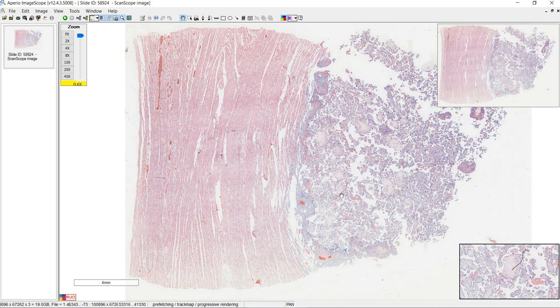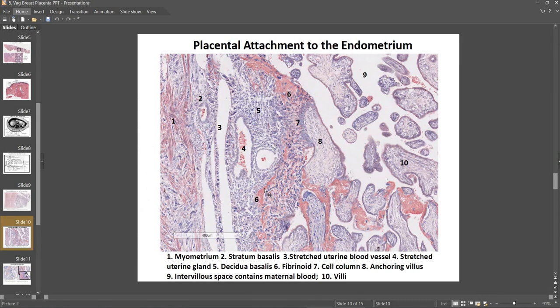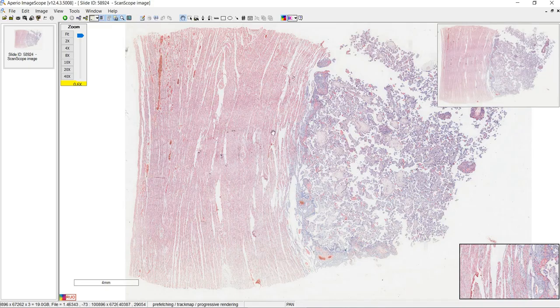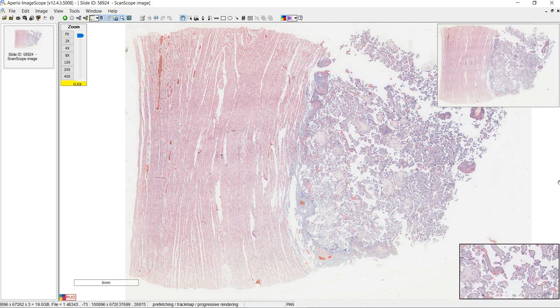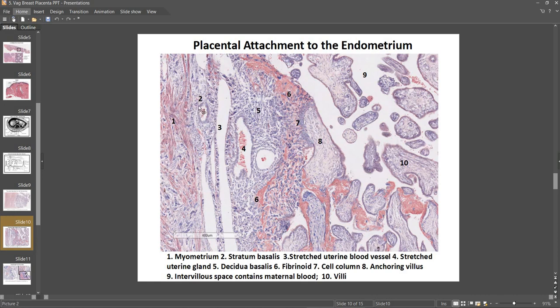Here we have the placenta. Two diagrams are very helpful to understand this: one from the lab manual and one from the PowerPoint. This is the maternal side of the placenta — on the left side we have the uterus, and going towards the right is where the fetus would be. Before, the endometrium was made up of the stratum basalis and stratum functionalis, but in the pregnant female we have a stratum basalis and decidua basalis making up the endometrium. We're going to find the uterine glands again, along with the blood supply. Note that the uterine glands were oriented towards the cavity before, but are now rotated about 90 degrees.